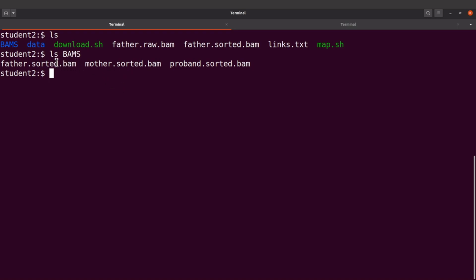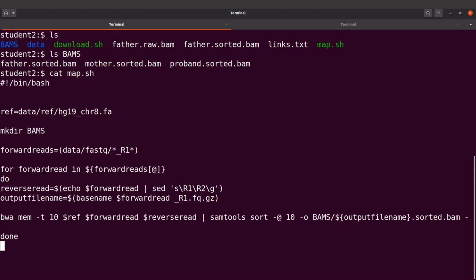You'll notice that because we had this bash script, things have been made easy for us. If you have hundreds or thousands of files, once you have the naming convention, then you can just write some simple bash scripts like we did, to display it, and then you'll be able to automate your mapping activity. So this is how we do it.